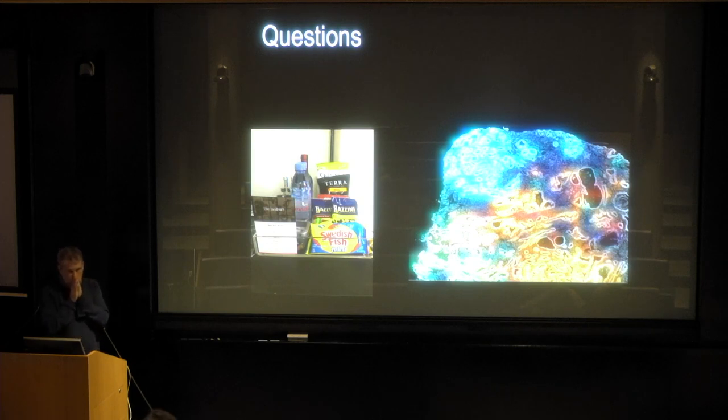Combining with the proteomics, when you're doing, say, the heart, what are the relative considerations with the proteomics data? Is that an emerging technology, as I'm not as familiar with that, or is it dense enough that we can actually do straightforward comparisons with the ST? Yeah, so that's a good question.